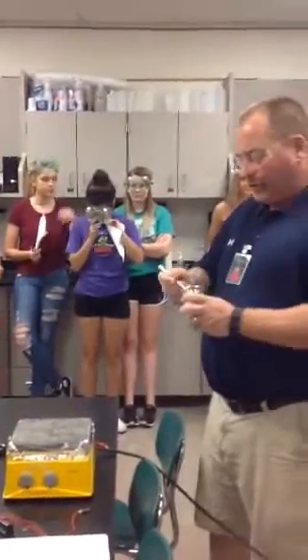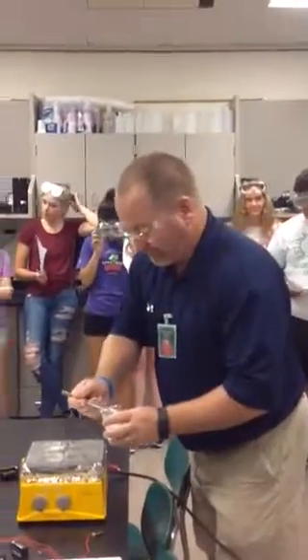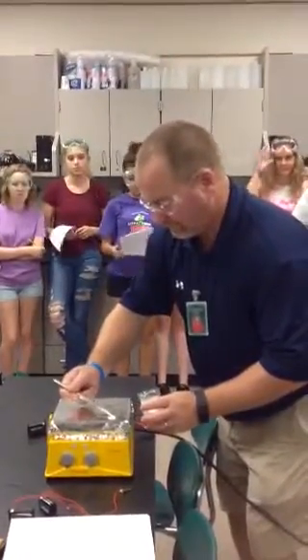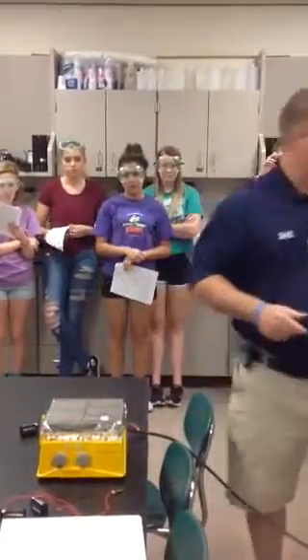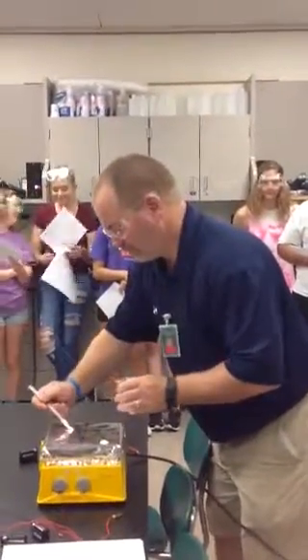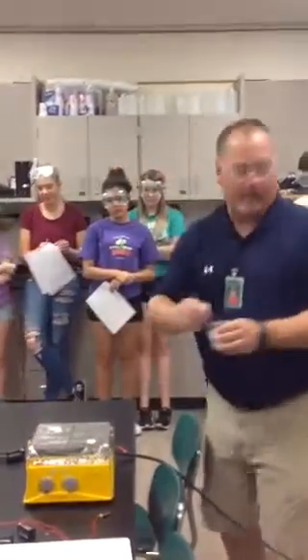This is calcium chloride, and I'm going to find my calcium chloride and put a little bit on there. Citric acid. A little pile on the citric acid square that I made.